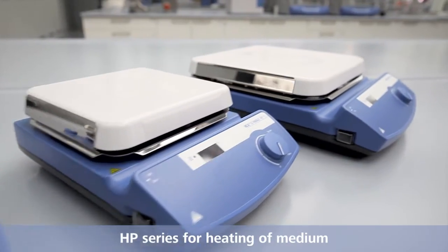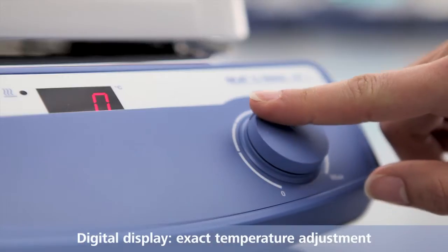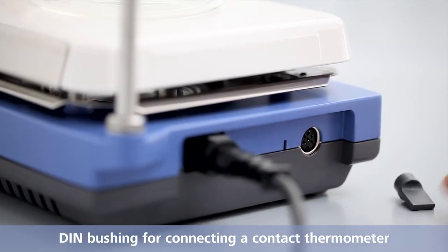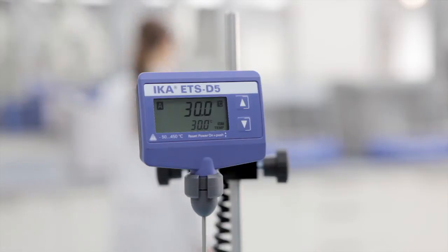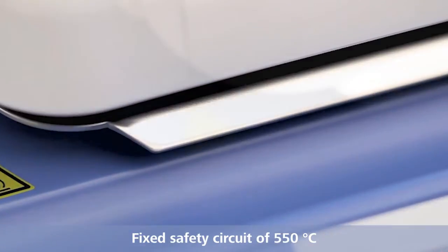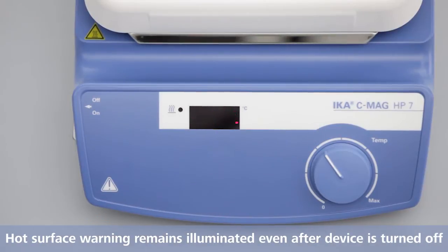HP series for heating of medium. Digital display for exact temperature adjustment. DIN bushing for connecting an electronic contact thermometer. Fixed safety circuit of 550 degrees Celsius. Hot surface warning remains illuminated even after device is turned off.